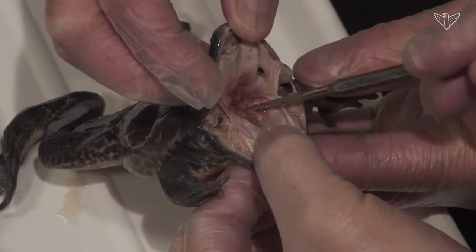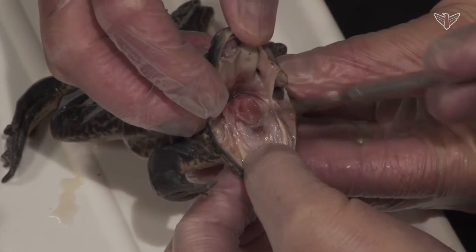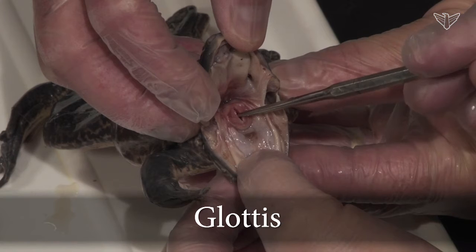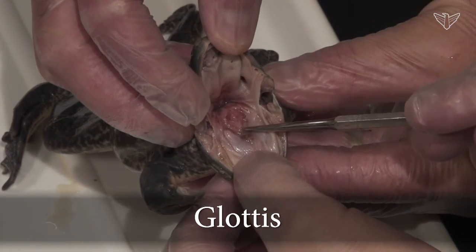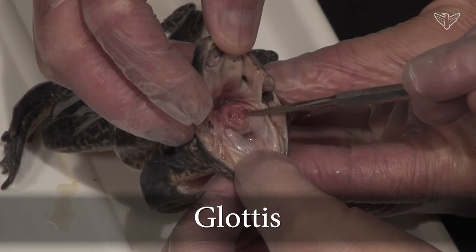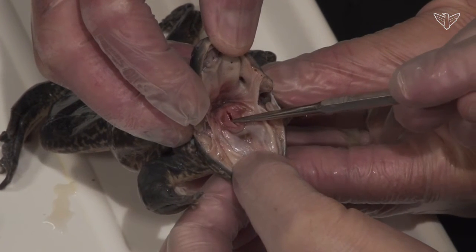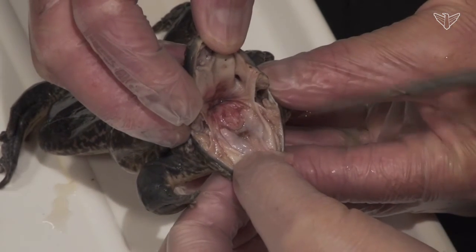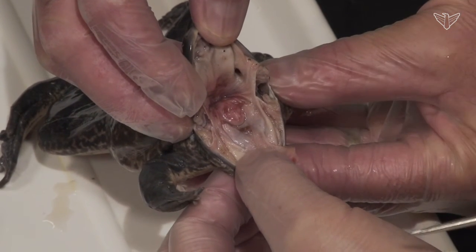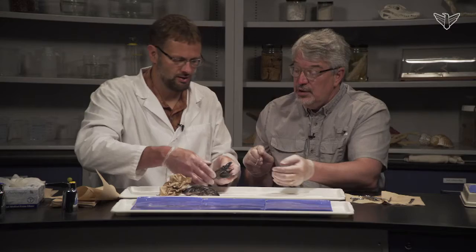And then probably the other nice structure to look at here, if we can find it, is right here: the glottis. You can see that. That's the opening to the trachea that goes to the lungs. And we have this too, we call it the epiglottis sometimes. When you're swallowing food, that closes, so food doesn't go into your respiratory tract and clog your lung. Very nice. Anything else on the outside here? No, not too much.